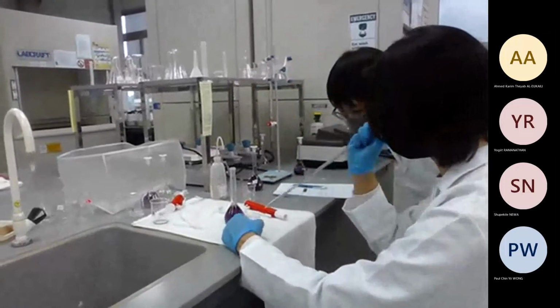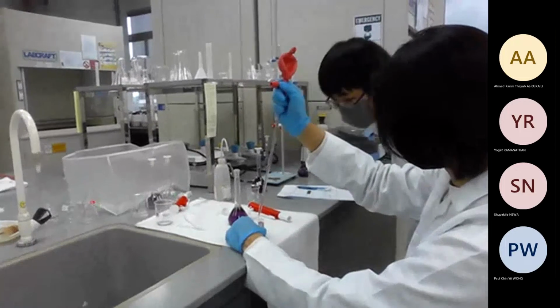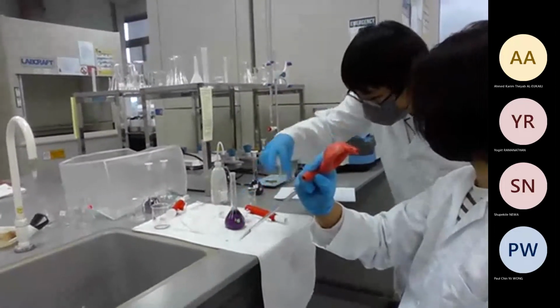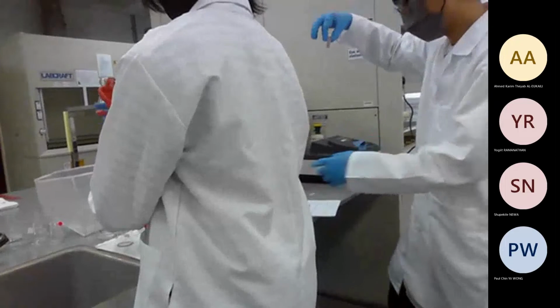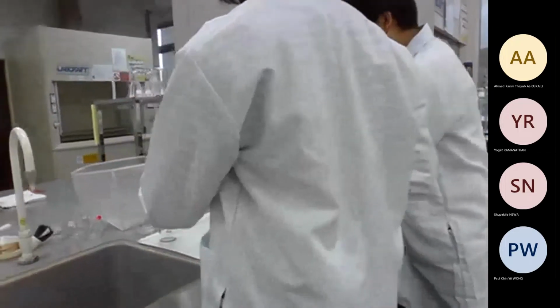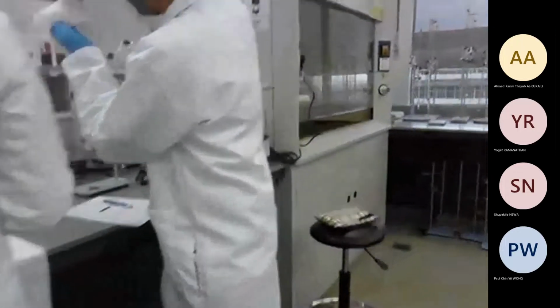A bit more. Yeah, should be okay. Should be enough. But make sure that it is clean. You wipe it. There is no bubble inside or no water. Yeah, no air bubble inside and no fingerprint on the wall. Then put it inside. Going to show.